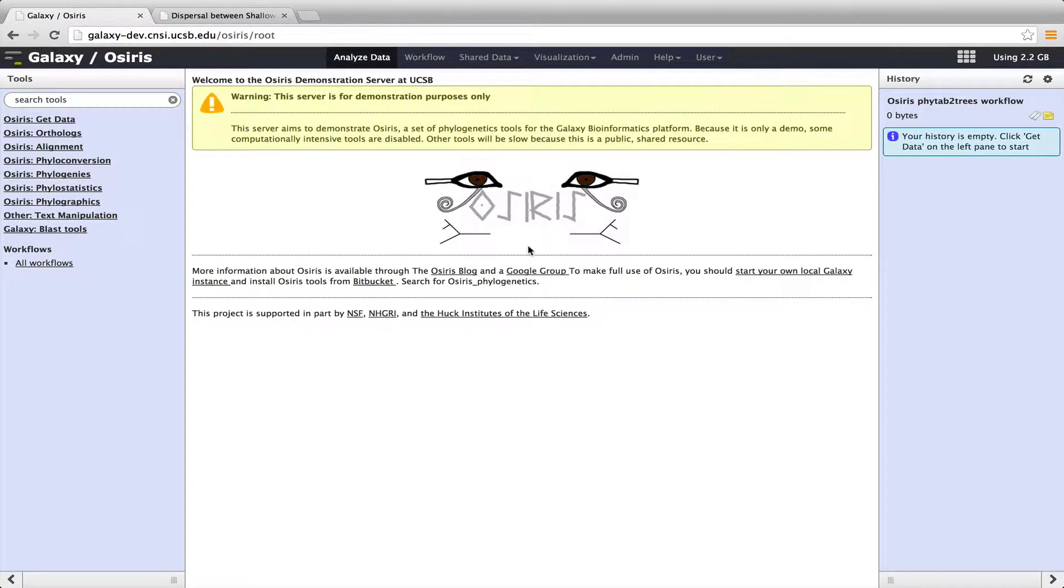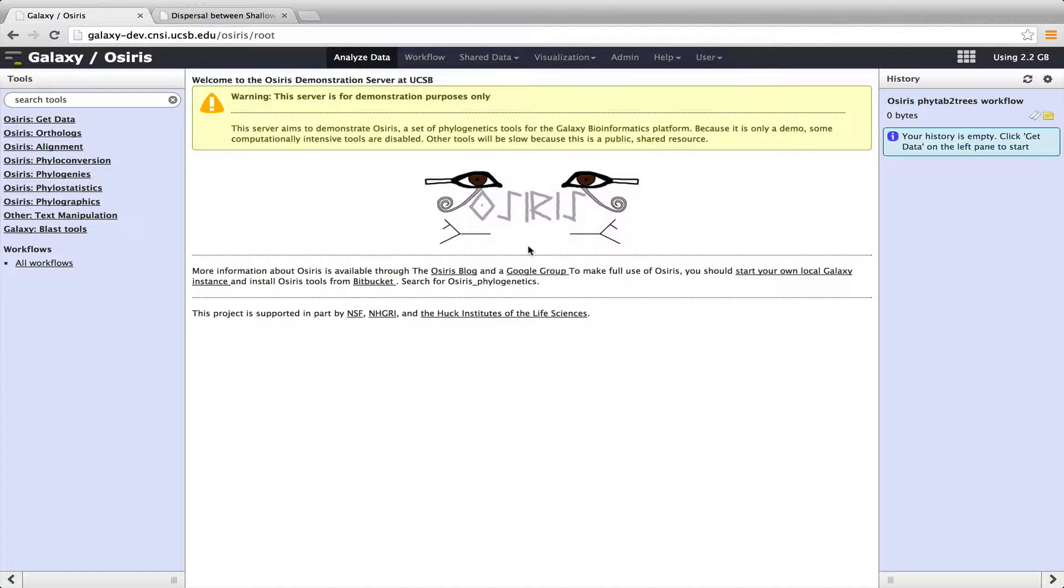This screencast will demonstrate some of the basic tools of the OSIRIS phylogenetics package, which is implemented within Galaxy, the Galaxy Bioinformatics Package. This screencast in particular shows you some of the basic features for conducting multi-gene phylogenetic analysis.